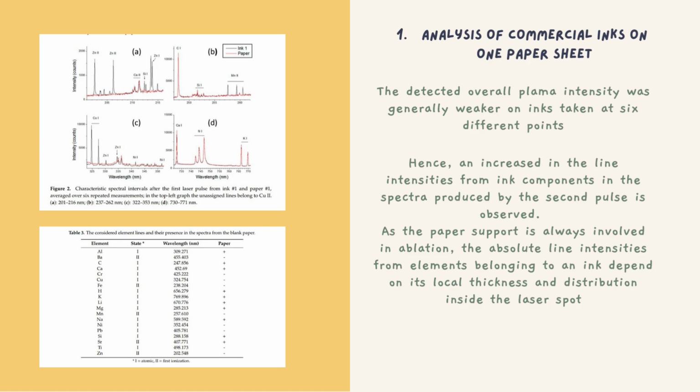The deposition of ink on paper does not produce a uniform layer, and the penetration depth is expected to be irregular and dependent on the ink, paper's properties, and the way the writing tool is used on the paper.